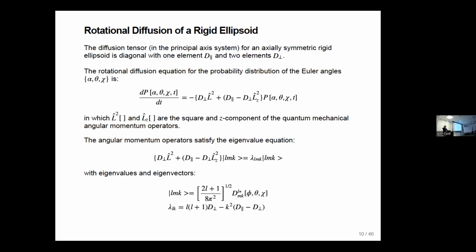Of course, the protein might not be a sphere, or an RNA molecule might not be a sphere. And the next step up in complexity is an ellipsoid. So either an American football or a flying saucer, where you have one unique axis and then two rotationally identical axes.